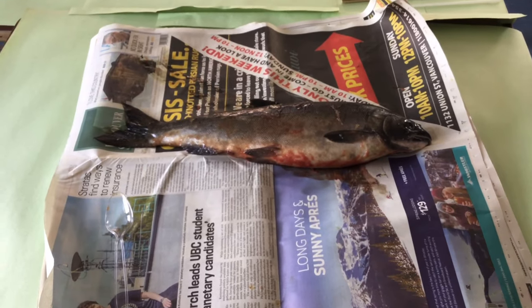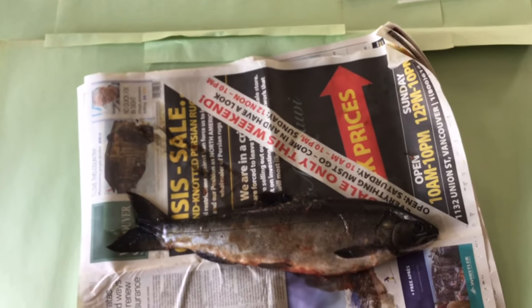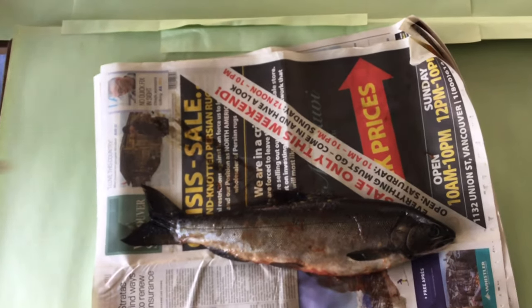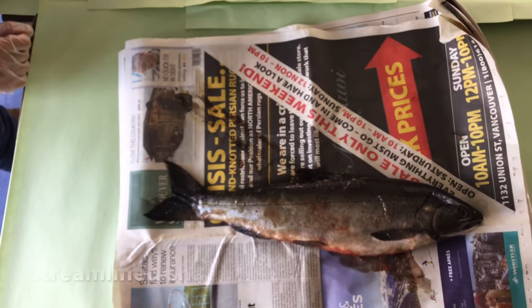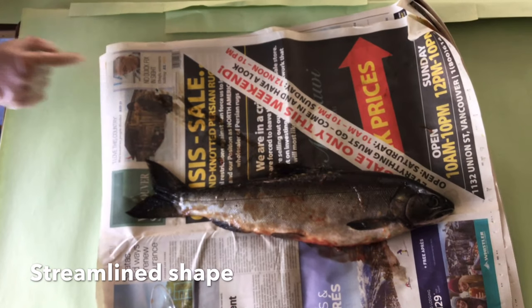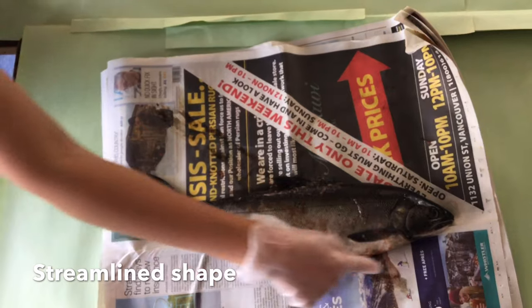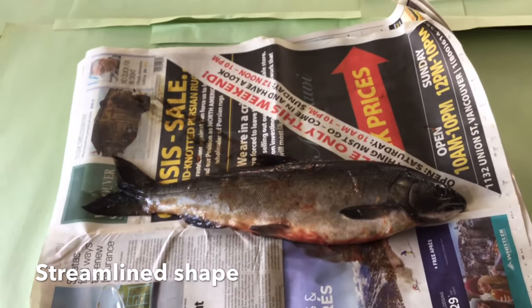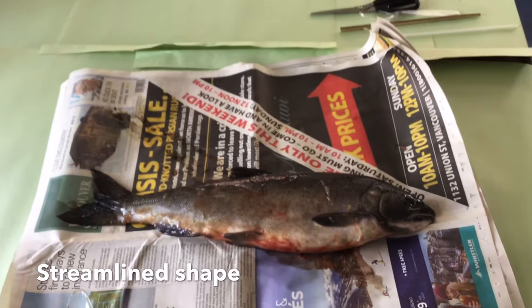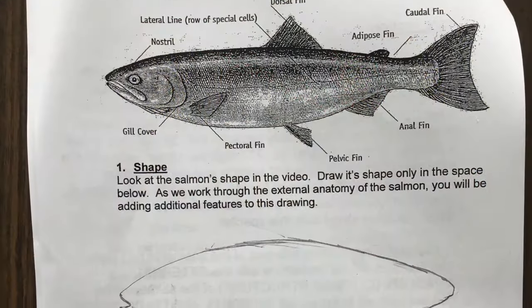Now, the first thing we're going to look at is the shape of our salmon. It is a streamlined shape. You will be drawing this in your booklet in the place indicated, just the shape. Now, this streamlined shape is very important. It helps the salmon. Take a moment to record the shape of your salmon on your salmon dissection sheet.